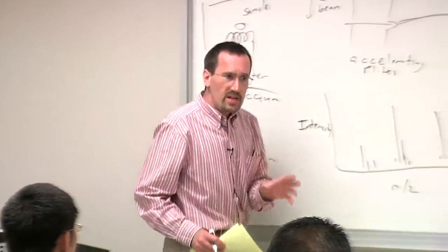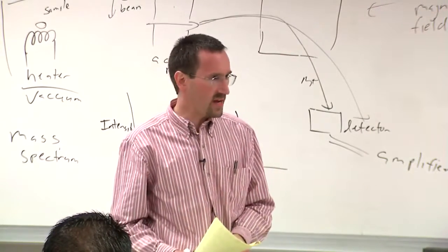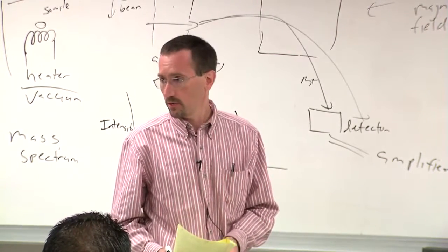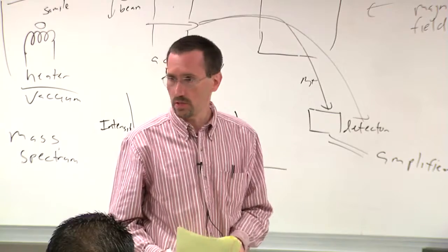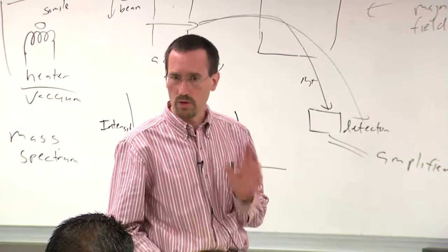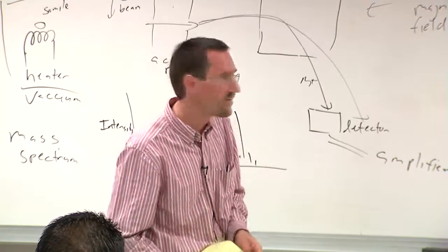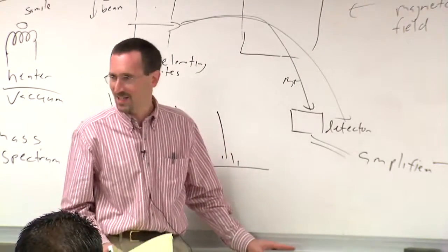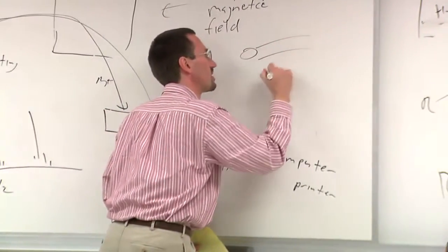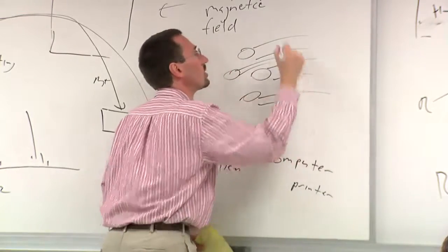There are lots of variations, and if you talk to John Greaves, he will wax. John Greaves runs the mass spec facility. We have one of the premier mass spectrometry facilities in the country. It's probably the best on the West Coast here because of John's innovation in putting together a really great facility with a whole bunch of instruments and great support and open access, and you can go there 24/7. If you talk to him, he will wax poetic about different sorts of detectors and so forth. So for example, another detector that's used is called a quadrupole detector.